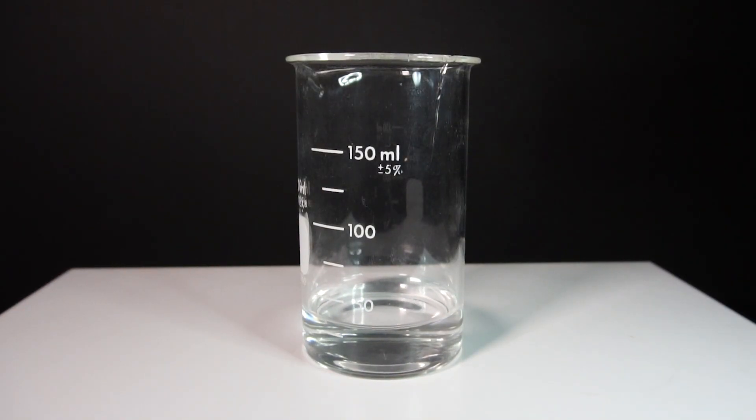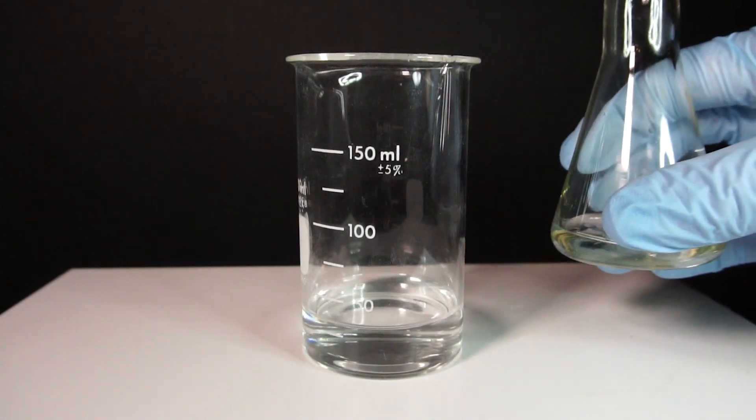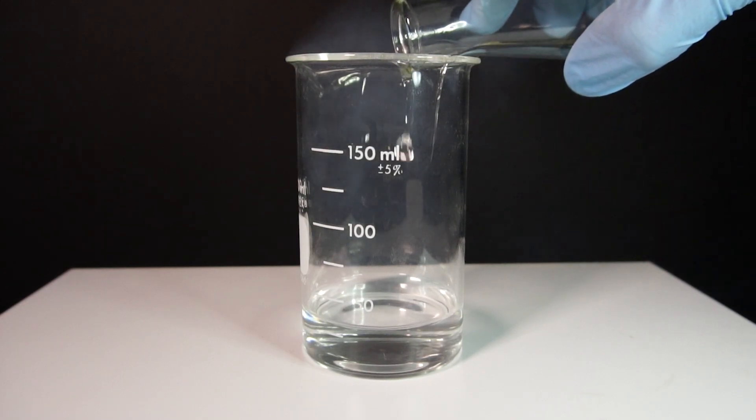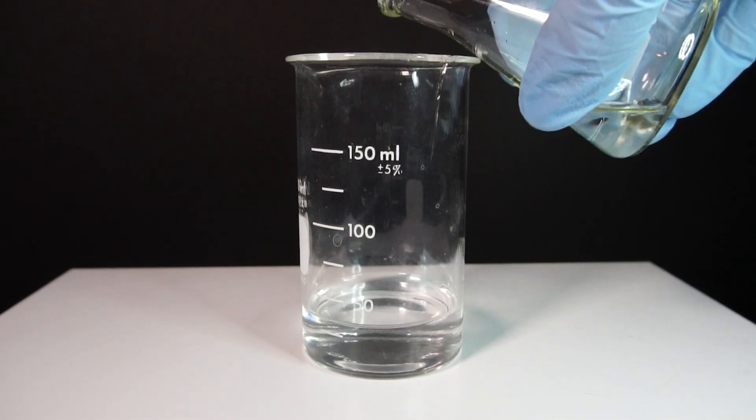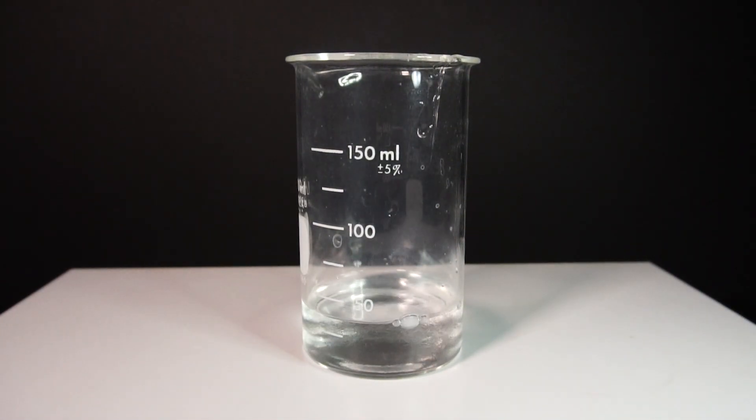First, we will add 30ml of ammonium hydroxide into a beaker and about 10ml of hydrochloric acid into a flask. Both of these chemicals are gases dissolved in water and they fume at room temperature. When the fumes come together, it makes a thick white smoke which is small particles of ammonium chloride being created.